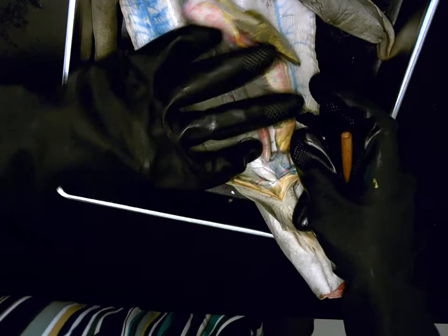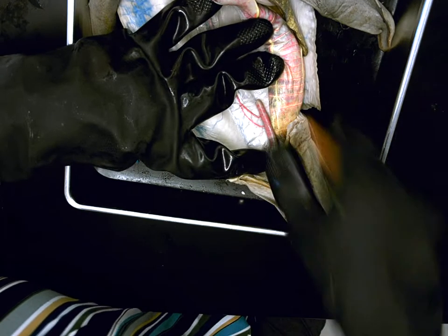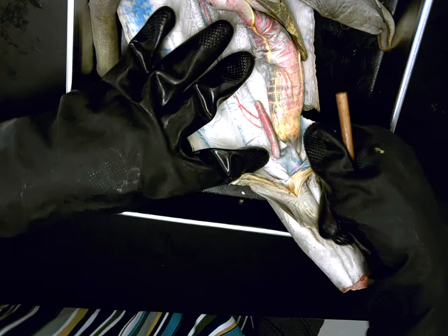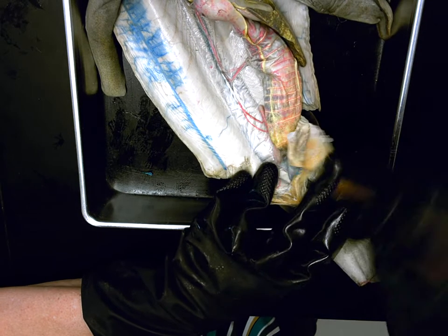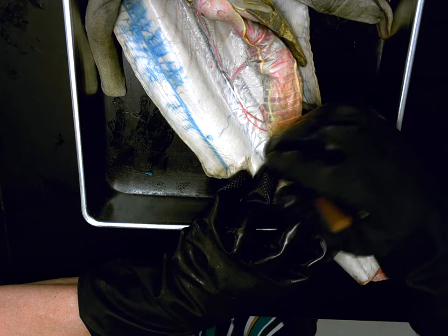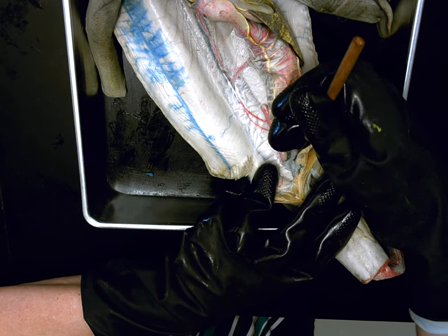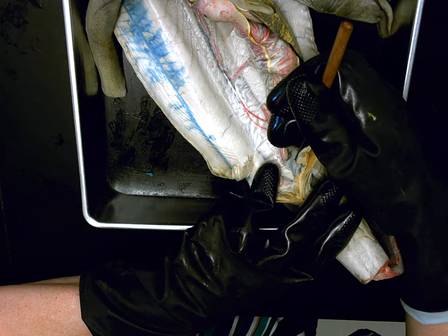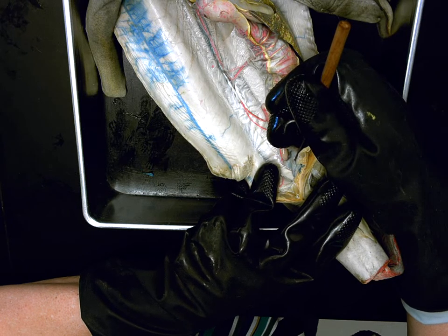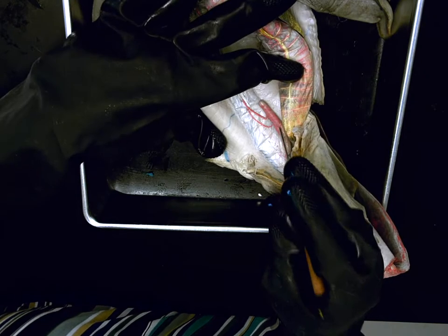All right, Alexis. So if I go down even further, pretty much you're going to see where this nice, beautiful banded intestine starts to narrow, and it usually becomes more of a whitish color, which would be this area right here. What is the name of this area, Allison? Rectum or colon. Function. Site for reabsorption of water and packing the feces. Excellent.